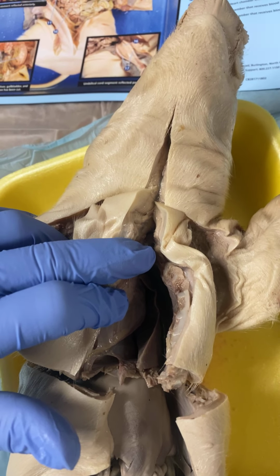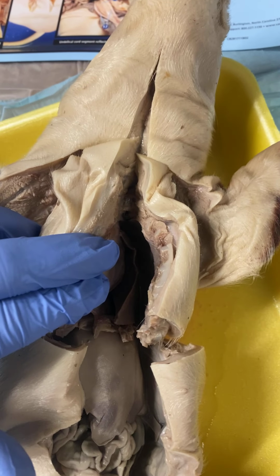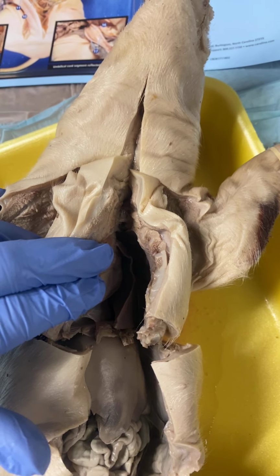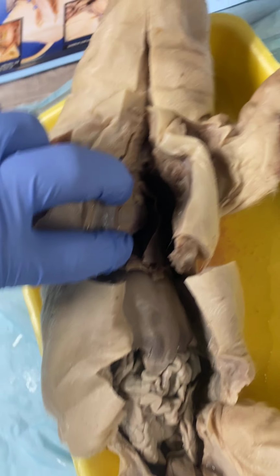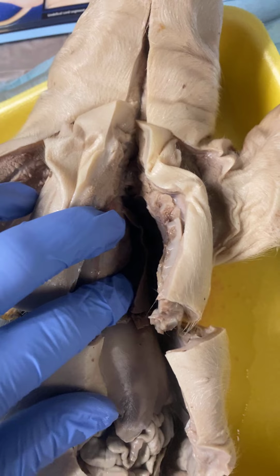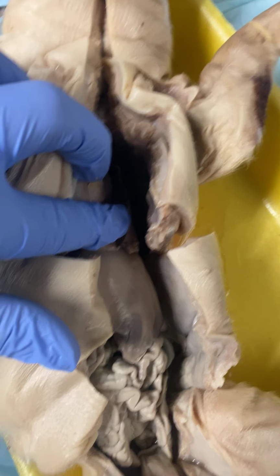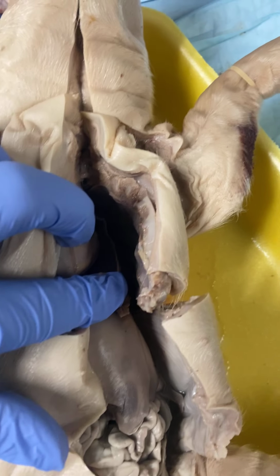Now, down here below it, you have the pericardium. It is a sac of specialized peritoneum that encloses the heart. It contains pericardial fluid. And then, right here, you have the heart. And the heart is the muscular organ that pumps blood through the body. Okay. Then right here, where my pointer finger is pointing, is the lungs. Lungs are the respiratory organs of gas exchange.